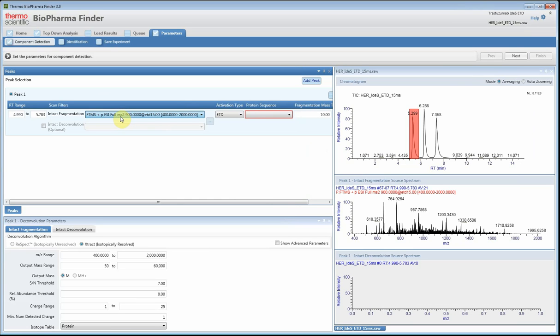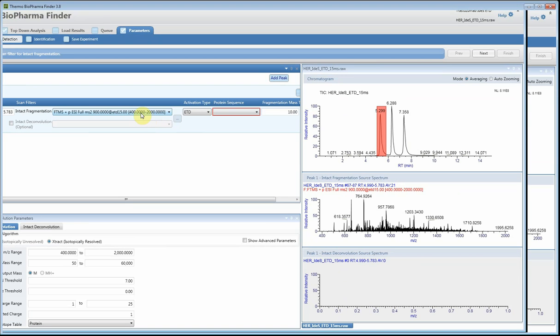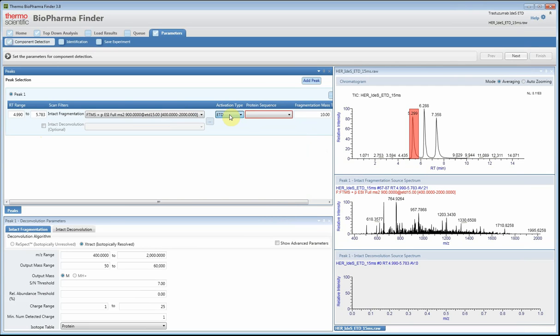In this specific raw file we had one targeted MS/MS at master charge 900, and the ETD was set to 15 — that's the scan header it will select. If there were multiple scan headers in the time window, you could choose a different one. The top-down workflow in BioPharma Finder does not require an intact full scan, but if you have that scan type you can select the checkbox to perform a full scan or intact deconvolution. The software reads the activation type from the scan header and automatically populates it, passing this information to the ProSight engine.